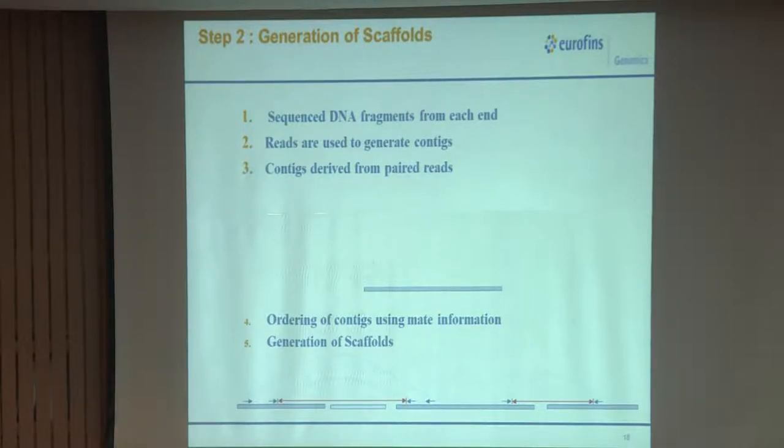Between two scaffolds, we cannot, but we also have a super scaffold. So if, for example, I'm using one software to do scaffolding, it might not have got an overlap between those two scaffolds. But if I use some other approach, like De Bruijn graph, and go for an overlap, there are several ways we can connect it. So if I use any other approach, I might get an overlap between the first scaffold and the second scaffold. Then I can combine it.